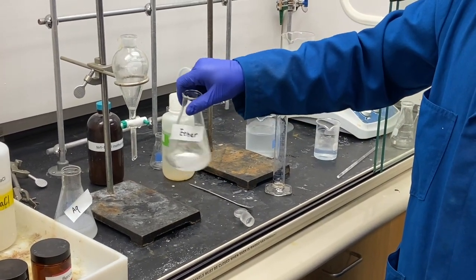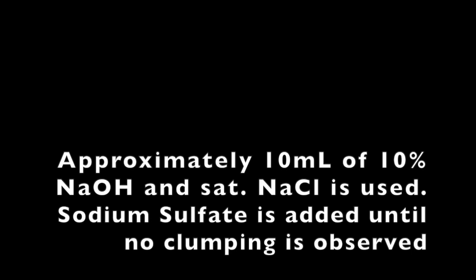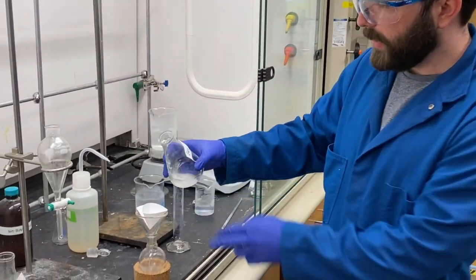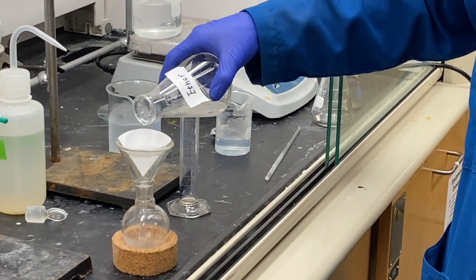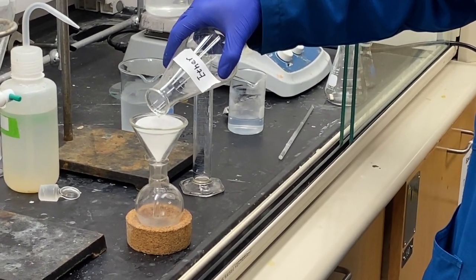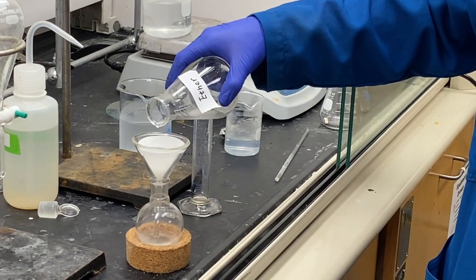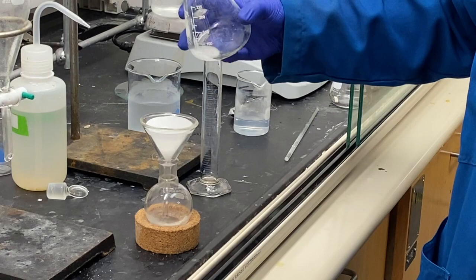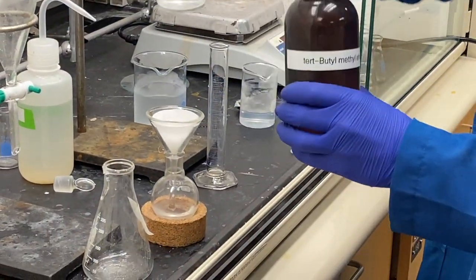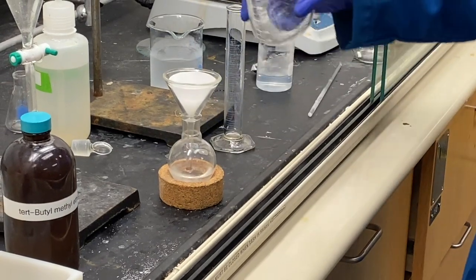The solution is swirled and allowed to settle. After settling and drying over sodium sulfate, the sodium sulfate is filtered off and the ether layer is collected in a 100 mL round bottom flask to evaporate off the solvent on a rotovap. The flask is rinsed with an additional amount of ether, and this is also transferred to the round bottom flask.